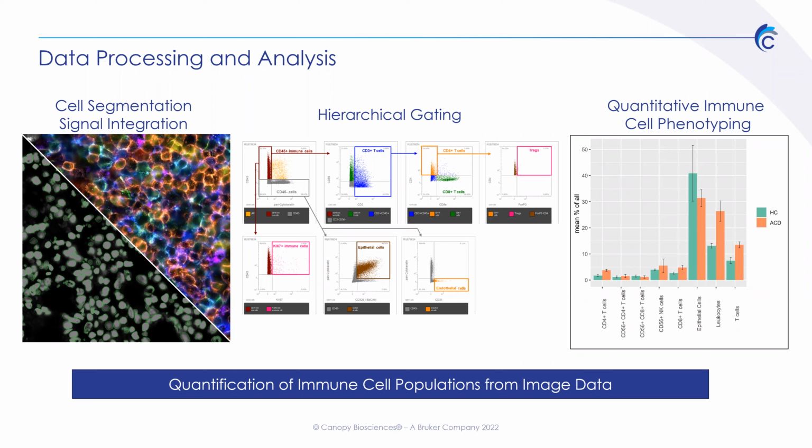Everything in the middle there is up to you as far as coming up with these assays. What we're trying to do is use a microscope to emulate what you can do with a flow cytometer. In the end, what we have is a comparison between pieces of tissue, regions of tissue, or alternatively, if we do a cell suspension, we could also look at differences in different treatments, whatever you happen to be doing. So that's the general idea. We use cyclic staining to add all these stains onto your piece of tissue or your cell suspension, and then we use image analysis to define those individual populations.